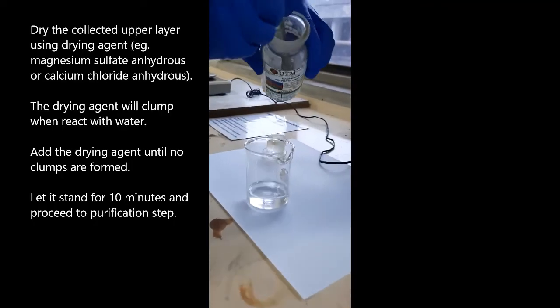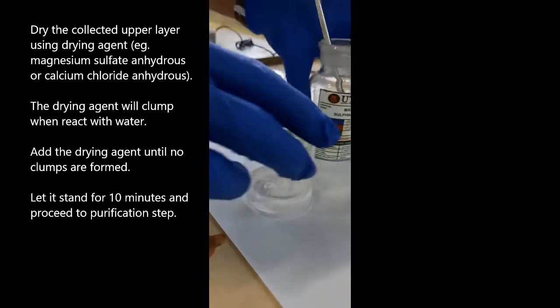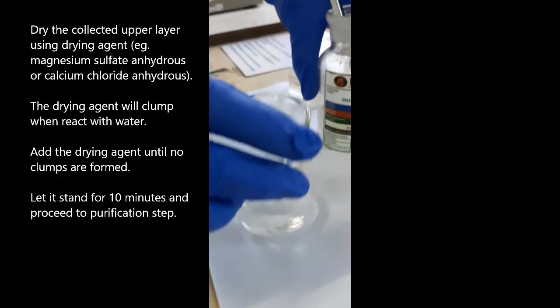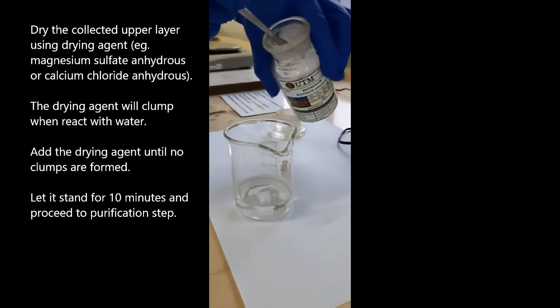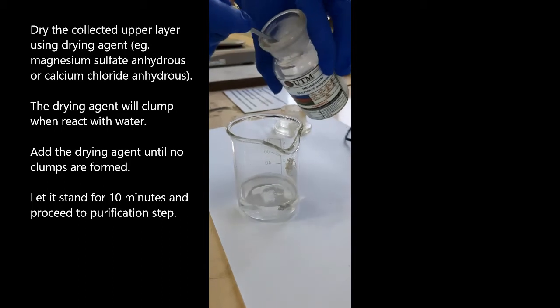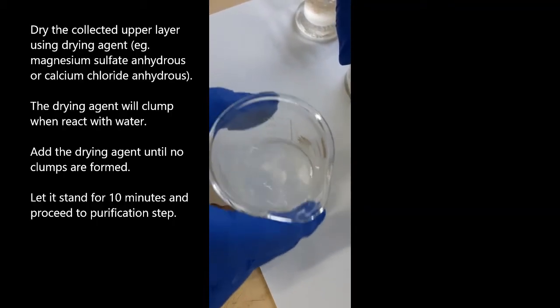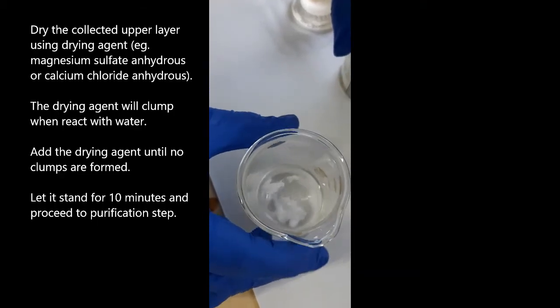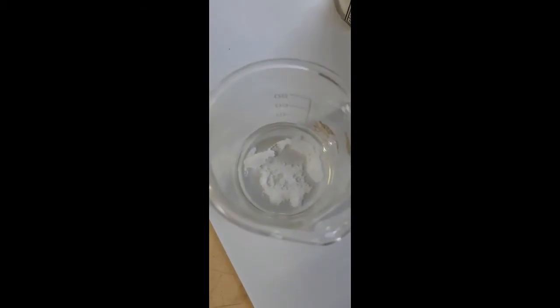Dry the liquid product over a drying agent. These can either be anhydrous magnesium sulfate or calcium chloride. Observe when the drying agent comes into contact with the liquid product. Surplus water causes the drying agent to clump. Add more drying agent until clumps are no longer visible. Let it stand for 10 minutes before proceeding to the purification step.